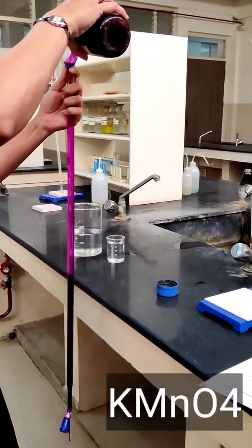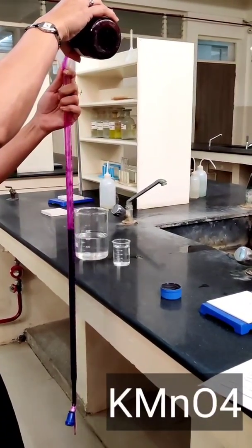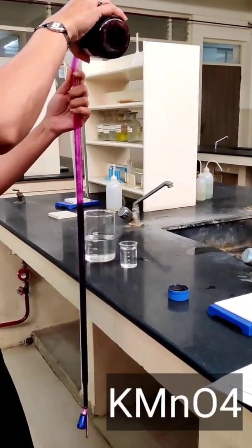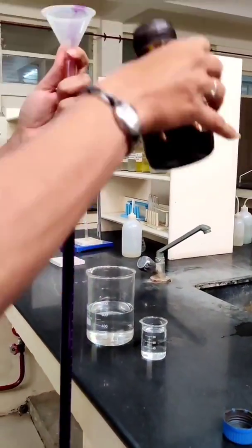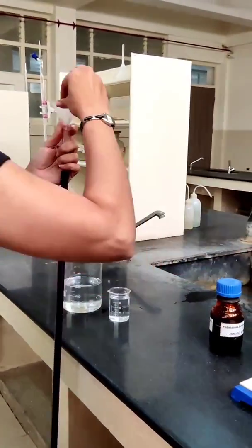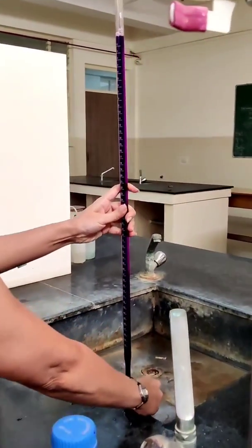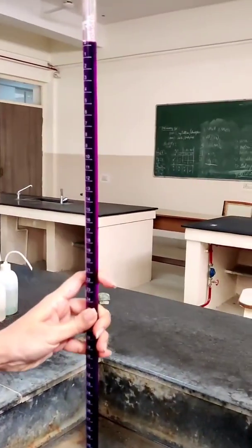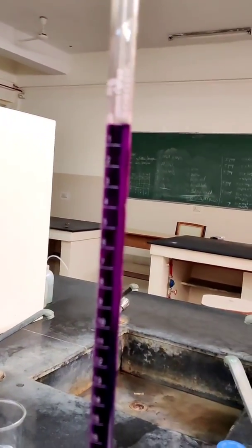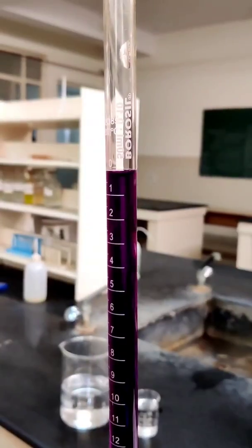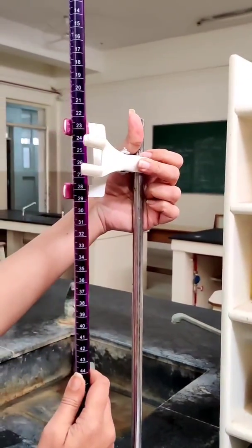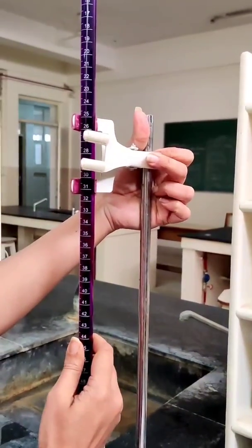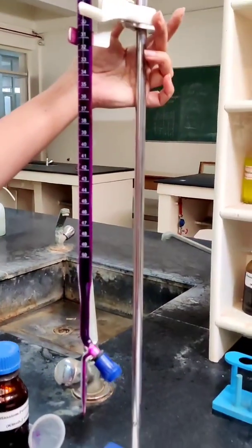Now, I am filling the burette with KMnO4 solution. Note down the initial reading. I have set the initial reading to 0.0. Now, clamp the burette to the stand.